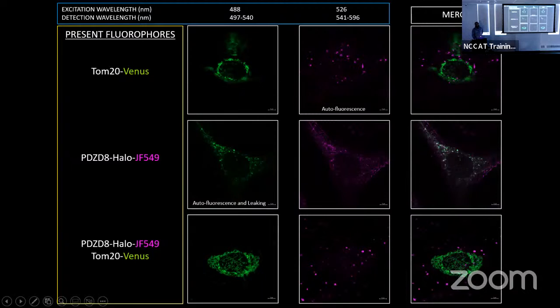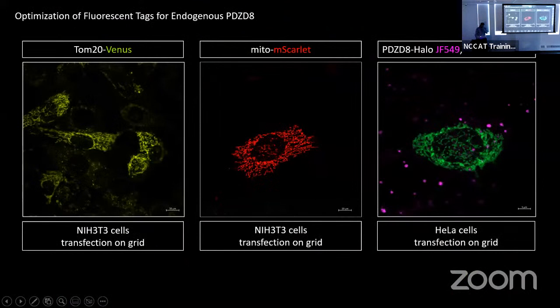I have a follow-up question. Did you actually see them mislocalize and sample somewhere besides the mitochondria? Oh, not in this case, no. That's partly because we introduced a mutation to the protein we eventually used as our guide, our beacon, and put the tag on it. We introduced a mutation that anchored it to only mitochondria. So I'm going to show you the fluorescence results from that, and it all overlays with mitochondria.